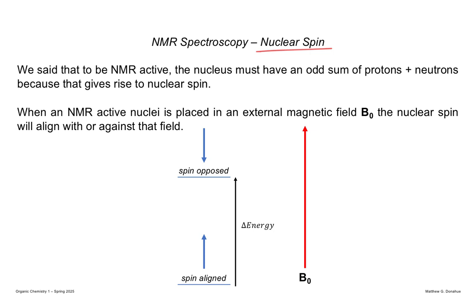And the way that the NMR experiment works is you have an external magnetic field. So if you've taken physics, that B sub 0, that's the vector for the magnetic field. And nowadays the magnetic field is basically generated through a superconducting magnet, which is like copper wire that's chilled to almost absolute 0, and that forms a magnetic field.